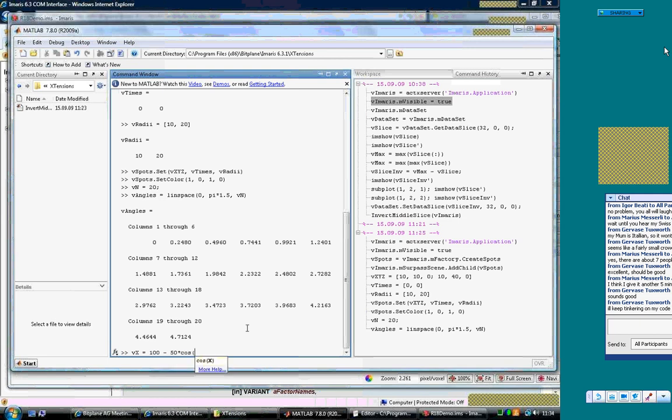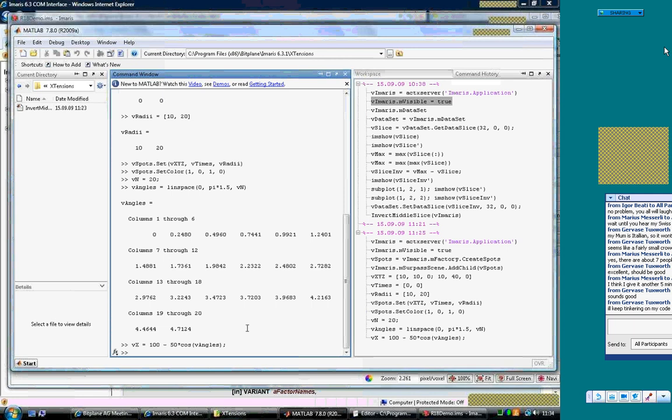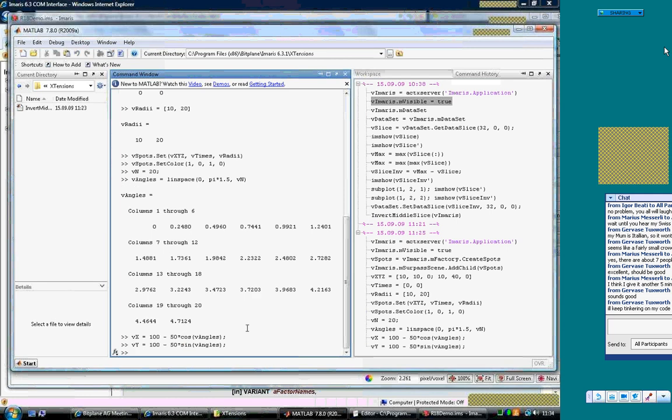And here we have the x value, and then for the y value we take the same, but using the sine function. We can have a look at them using the plot of Matlab, x, y, and say we want points. Here you see our 3/4 of the circle.